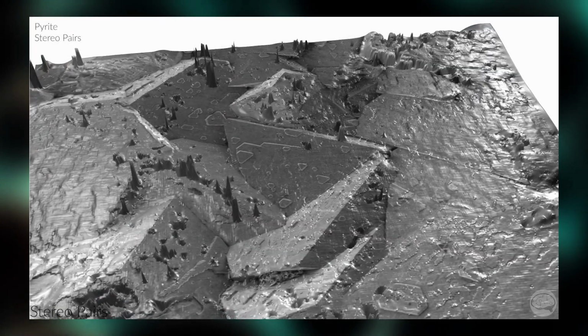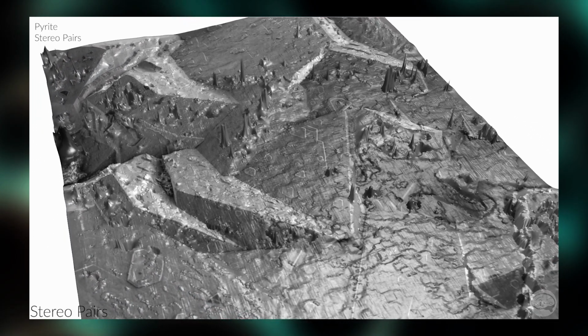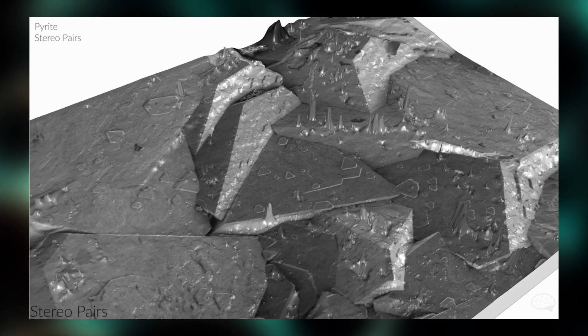What kind of reconstructions can we do? There are two main methods that are commonly used today, and there are two others that I will mention that I think show some future promise. Stereo pair. This one is fairly quick and fairly simple to do. You just take one image of your sample, tilt the stage around 5 degrees, recenter your sample, and then take another image. That's basically it. Some software will give you the option to include 3 images, but 2 is fine.